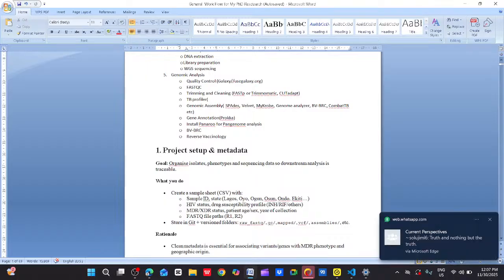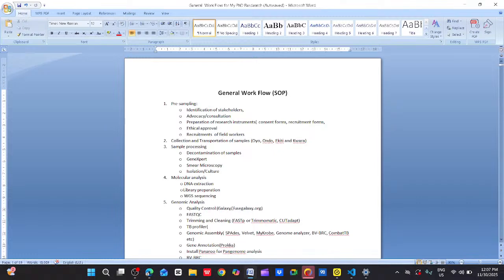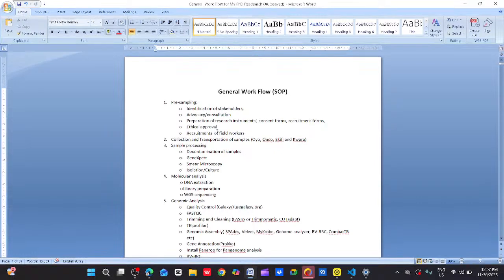So we will now try as much as possible, because the isolate we have been dealing with in Galaxy, that we have been running all this while, was just an isolate from Kwara, that is, from one side. That is, we have only one strain. So that is telling us that we need to get more strains. That is going to be the next task for us now.